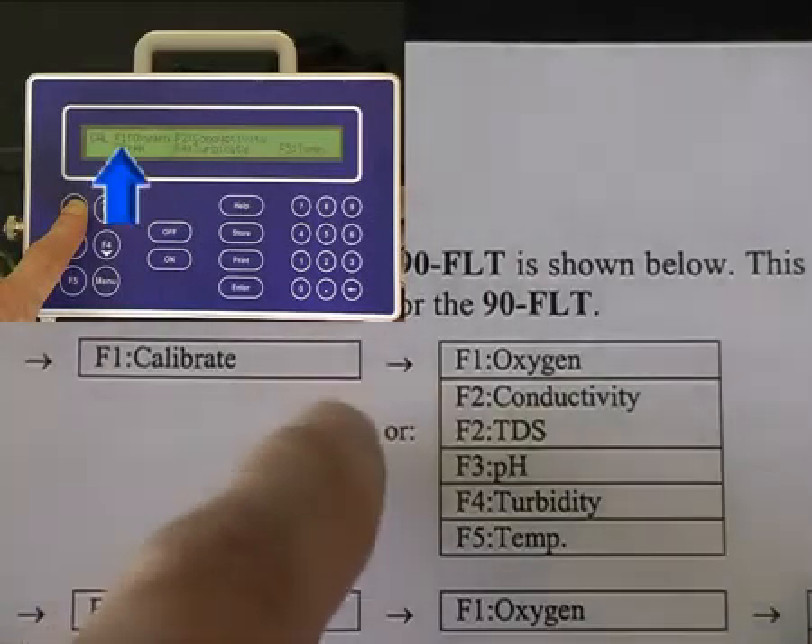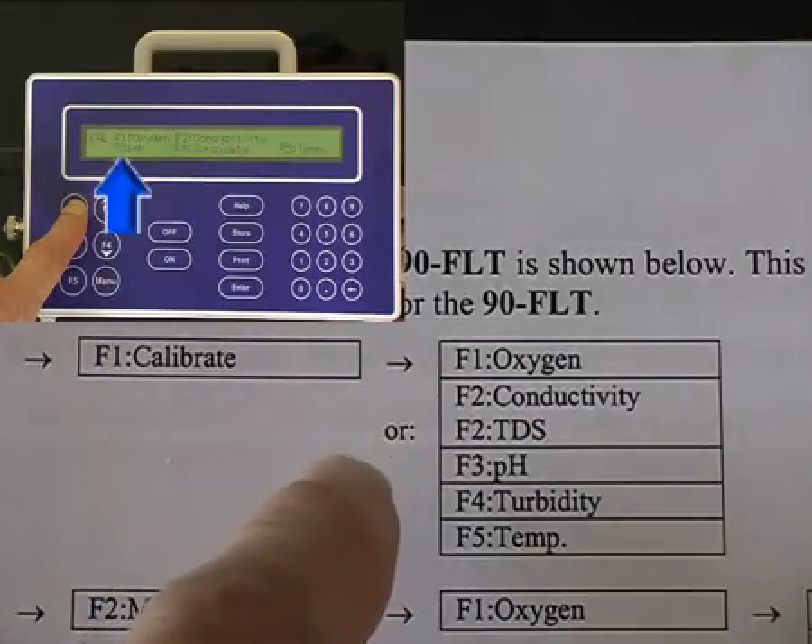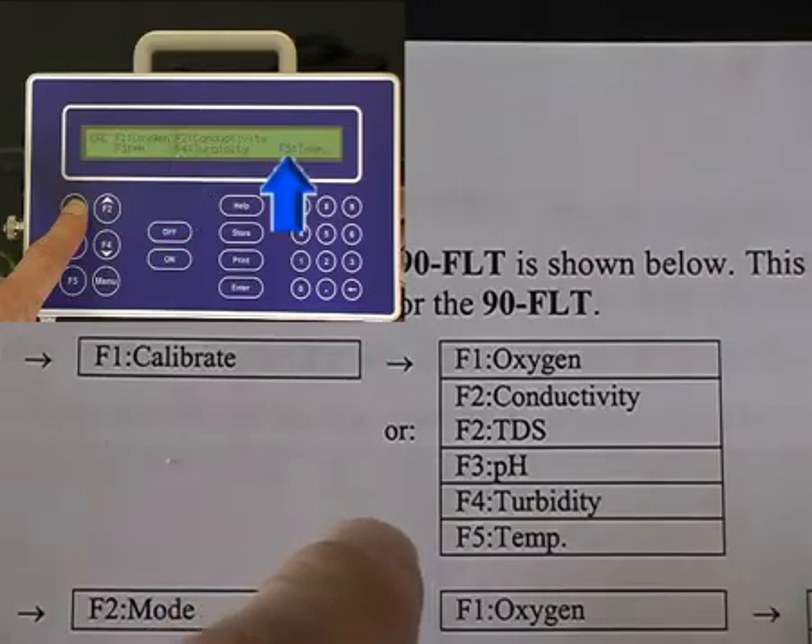F1 is oxygen, F2 is conductivity or TDS, F3 is pH, F4 is turbidity, and F5 is temperature.